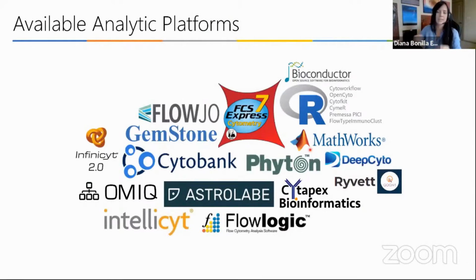The good point is that you don't need to do it on your own. There's so many options. Well, if you're good at programming, you could go for R, MATLAB or Python and find the scripts, Bioconductor, create your own. And traditional software that also have these tools for clustering and dimensionality reduction. And we will see more from Tim.